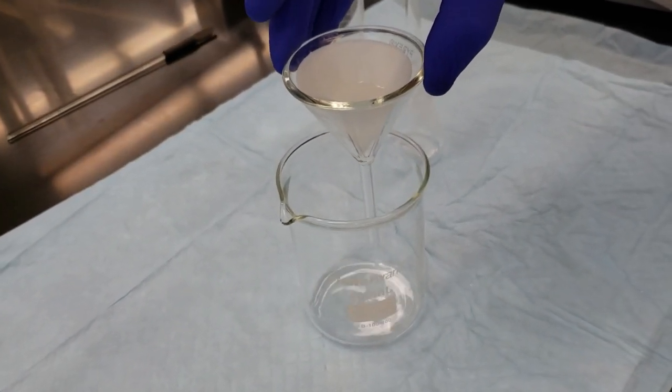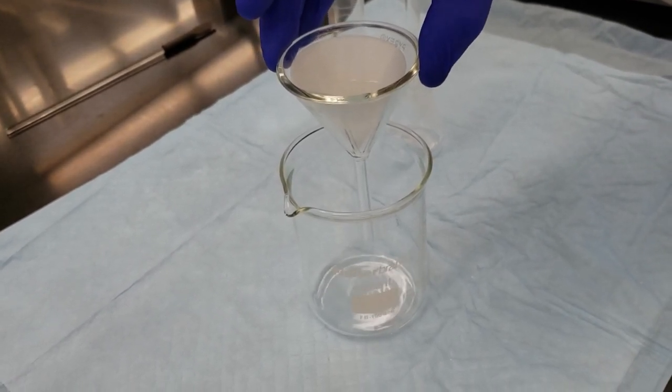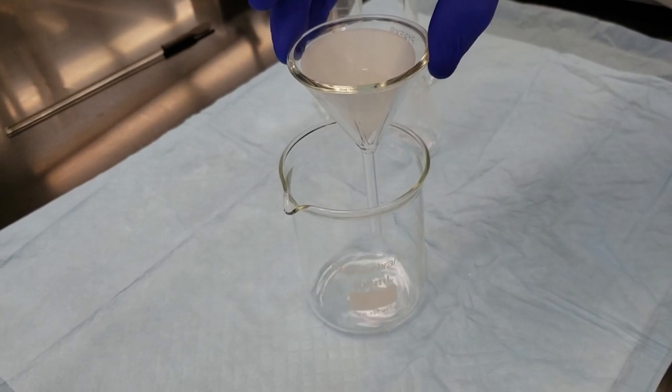This can take a little while. Once it's finished draining through our gravity filtration setup, we'll come back to get everything set up for the hot plate.